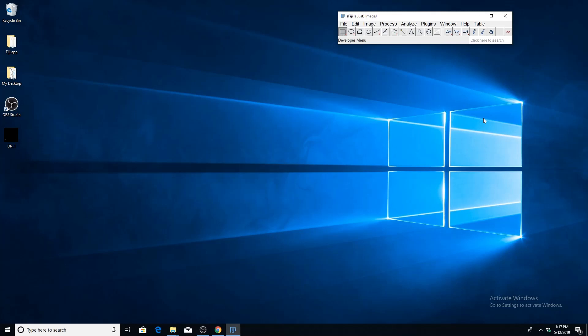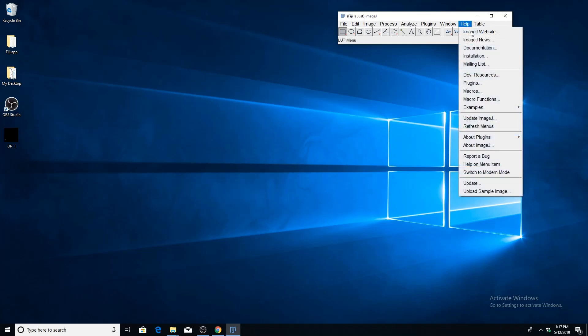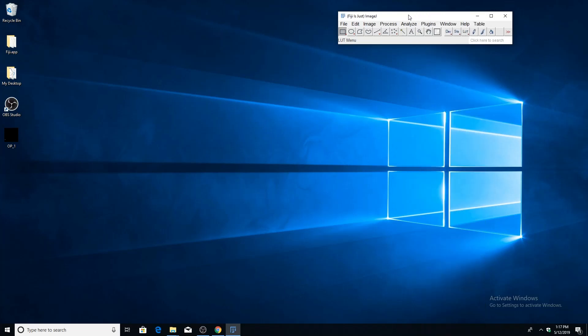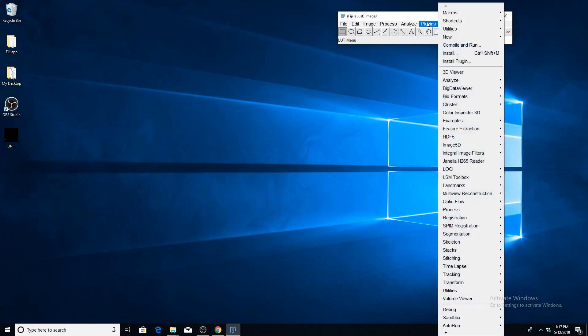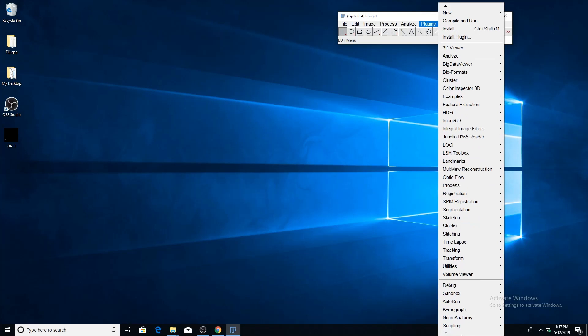In this video I'll give a brief introduction to tracing with SNT. Let's get started. First, make sure you have Fiji open and that it's up to date. Go to the help menu, then down to update. Once you're all up to date, we can open the SNT plugin. One way to do that is to go through the plugins menu, navigate down to the neuroanatomy toolbox, and select SNT.